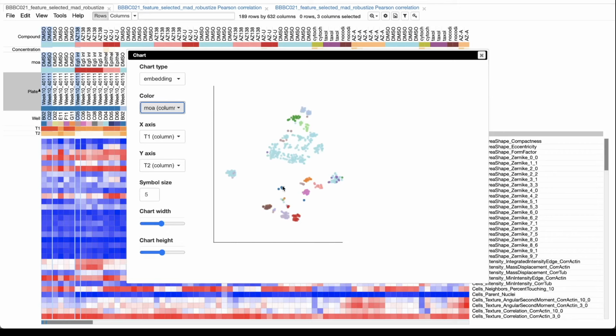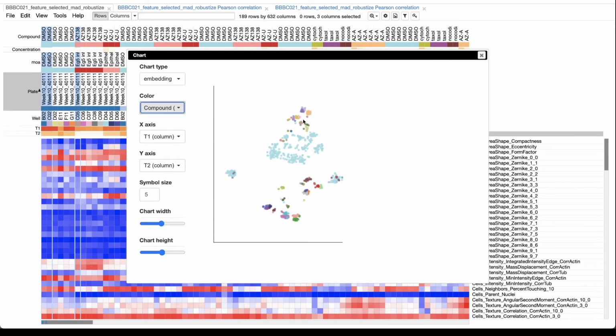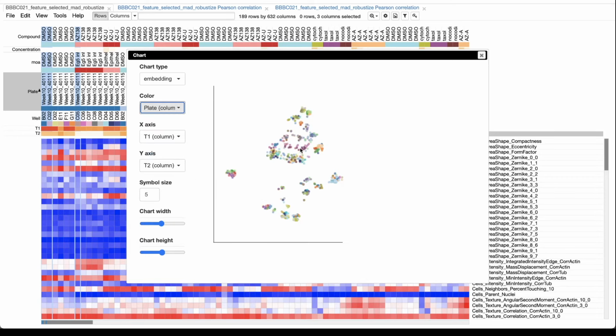And what I mostly see are relatively tight clusters. Certainly not perfect. This blue guy is all the way off over there, but we have a pretty tight cluster of red, of purple, of blue. And if we look at drug instead, we do see that multiple drugs are living inside the same mechanism of action cluster. But if we change our sorting to look for plates, the plates are very well scattered, indicating that, again, mechanism of action is stronger than things like plate effect in this experiment.